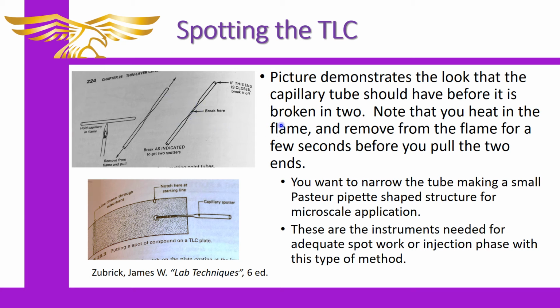I think it's important for safety reasons that when you break this, you put a couple of paper towels and wear some gloves or something like that, and apply pressure gently that way and break it off in one shearing force motion, as opposed to trying to break it over the glass disposal or some other kind of method. We don't want you to get anything in your hand or anything like that. So there is a correct way to break and a non-correct way. And I would prefer you use the correct way.